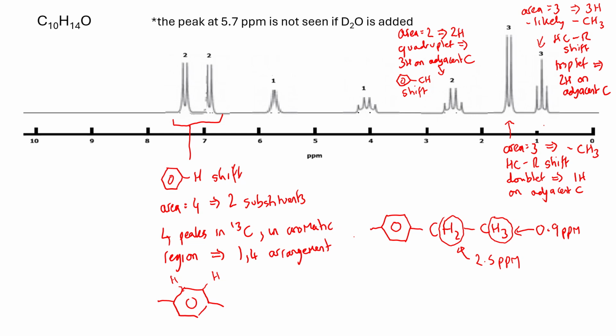So again, we've got another bit of structure now, which we know is going to take its place over here, but let's put that bit of structure together on its own and then we'll just join them up. So we know we have a CH3 here attached to a CH from the splitting, and we can say that this CH3 is the peak at about 1.5 ppm.